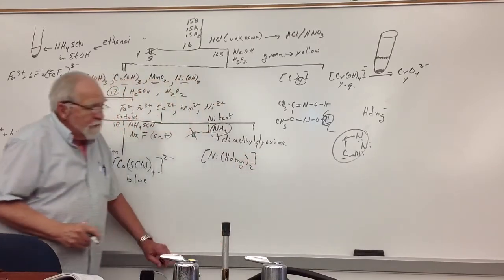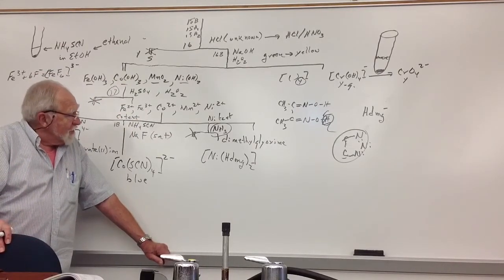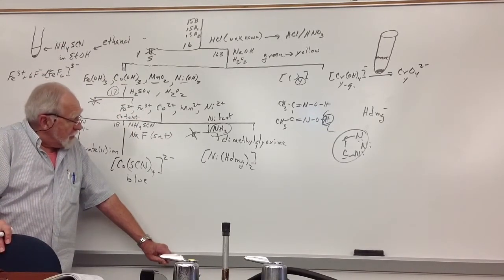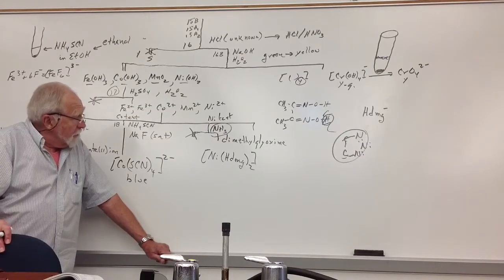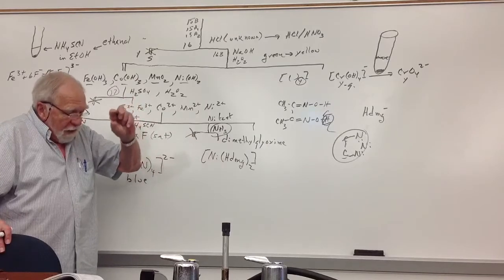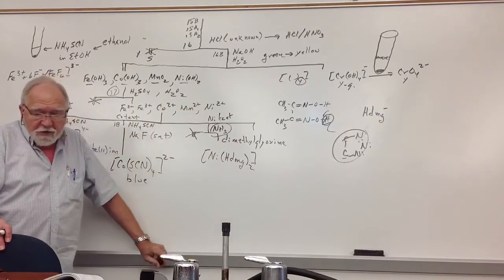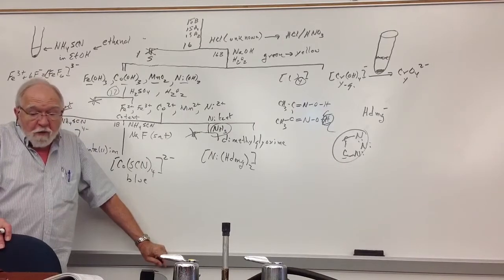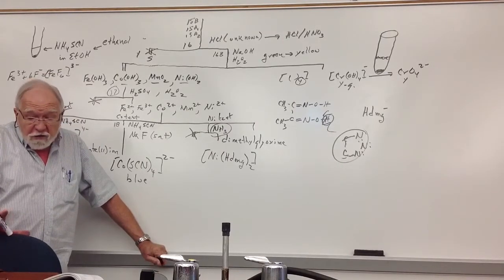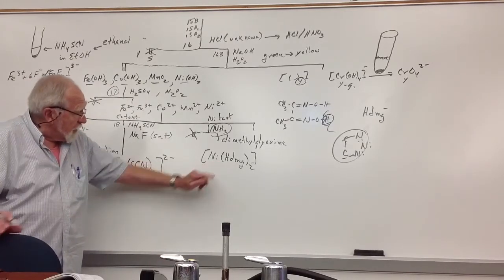It's a strawberry red precipitate. Book has a lot of fruit colors in here. So it's a strawberry red precipitate. It's bright red. Usually what happens if people don't make this basic, they see red around the top of the test tube and on the glass, but they don't see red in the solution. Or if they see a red color solution, that's not the test for nickel. It has to be a precipitate.